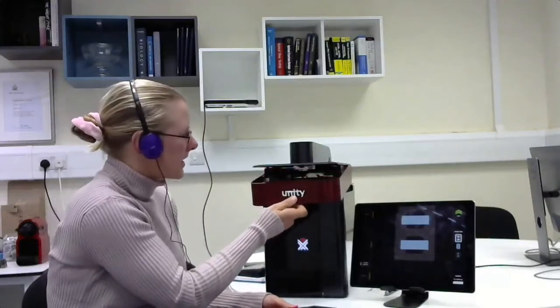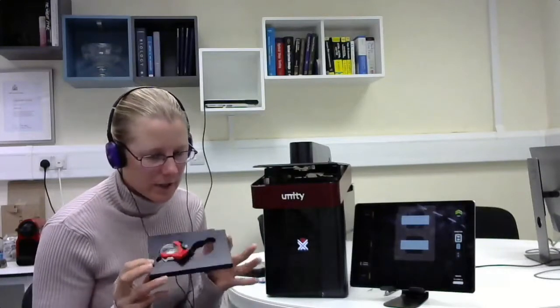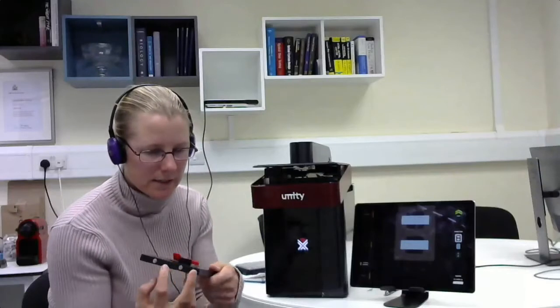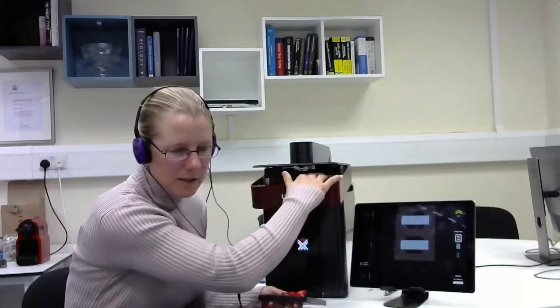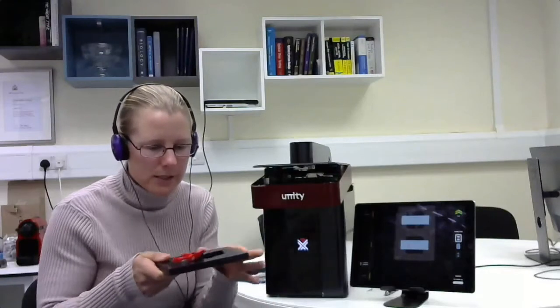So the front of Unity - here is the sample stage, and this is where the sample goes in. We have a range of sample holders: the Petri dish holder, the multi-well plate holder, and at the moment I've got the two-slide holder inserted. These are inserted into the XY stage and located by just a couple of magnets on the system, so they're just held gently in place. The stage itself rests on a glass platform, and our XY stage moves the sample holder around like a hockey puck on ice.